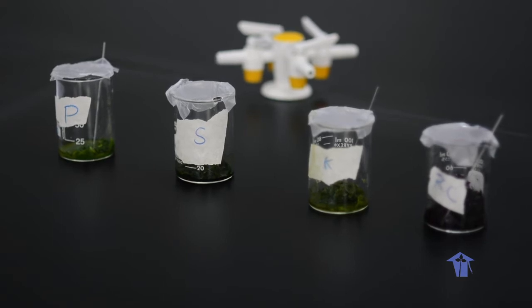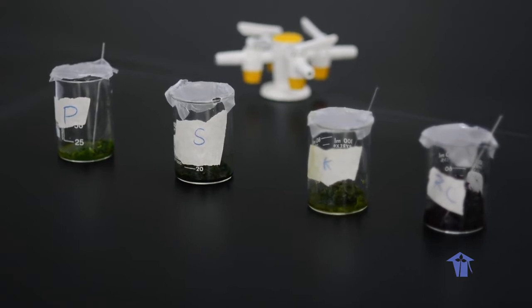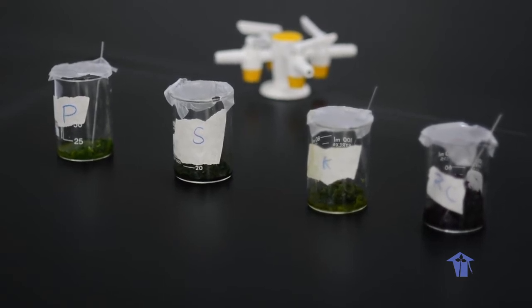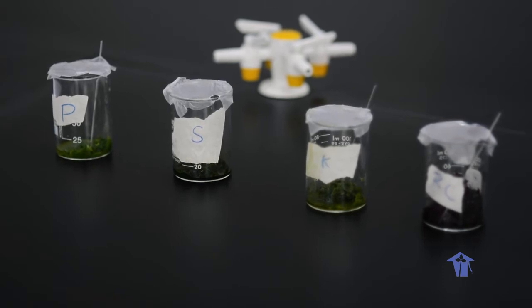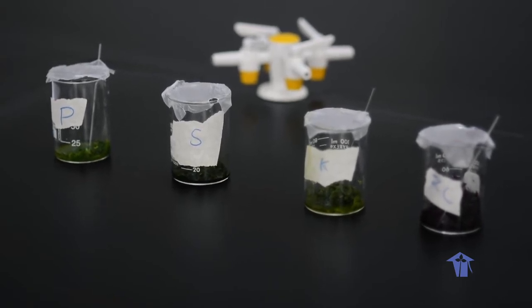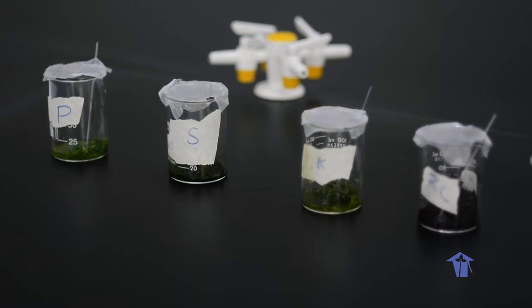Although we look at leaves and we see primarily green, there are many different pigments that contribute to the overall color that we see. What we are doing today with this chromatography lab is to separate the pigments which are present in a selected set of leaves.